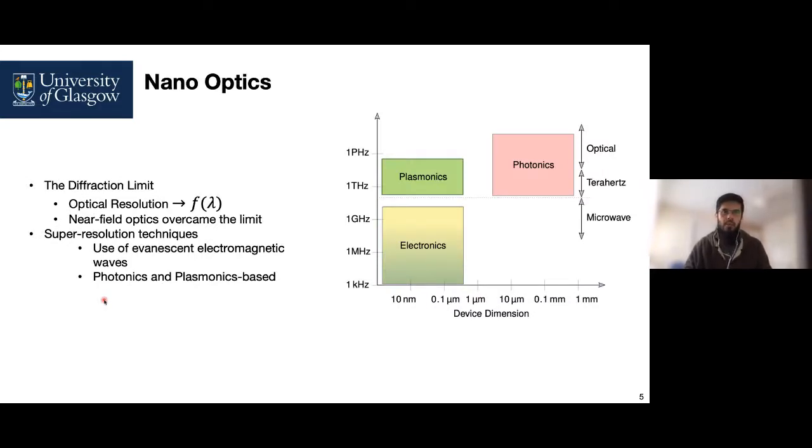Now, as we have seen, the resolution of microscopic techniques has gone higher and higher, and especially in the last few years, there has been a lot of development.